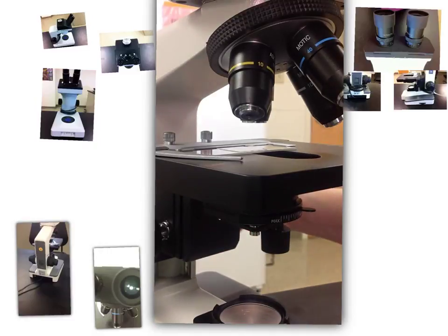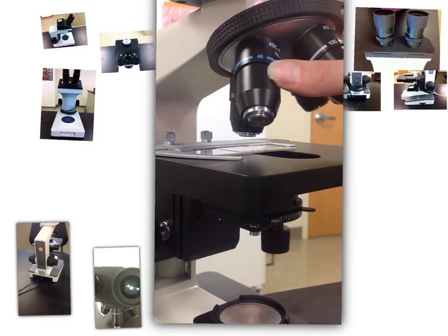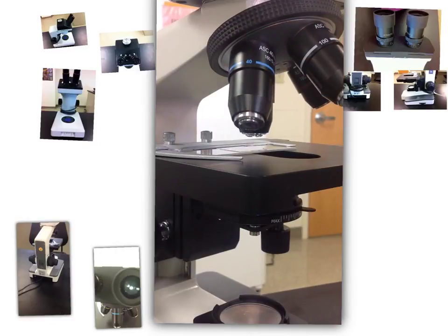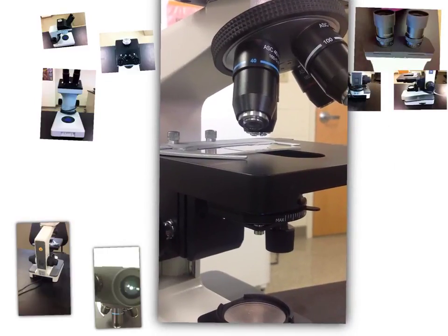And as you're doing this, you're looking through the microscope. You want to see if whatever you're looking for comes into focus. Now something I didn't do here that I want to point out. If what you're trying to see is not there, you're going to want to move your slide to that center. So you're going to want to move your slide a little bit over and either back and forth, up and down. Just to make sure that it is in the center. My organism happened to be right there, so I didn't have to make any adjustments.